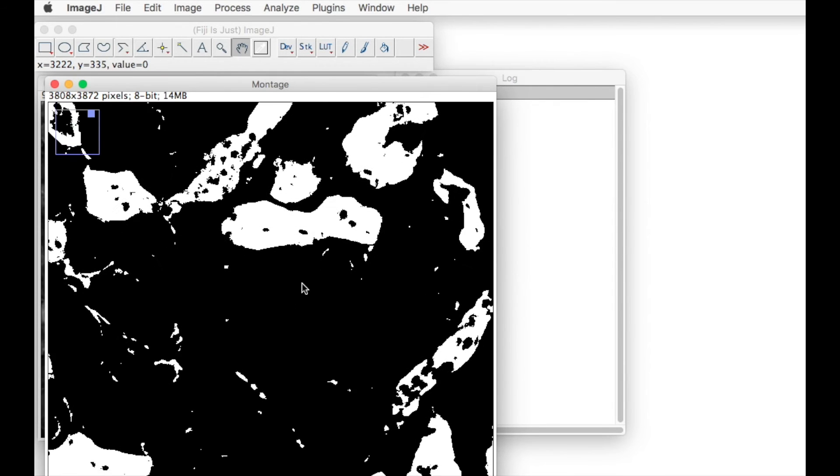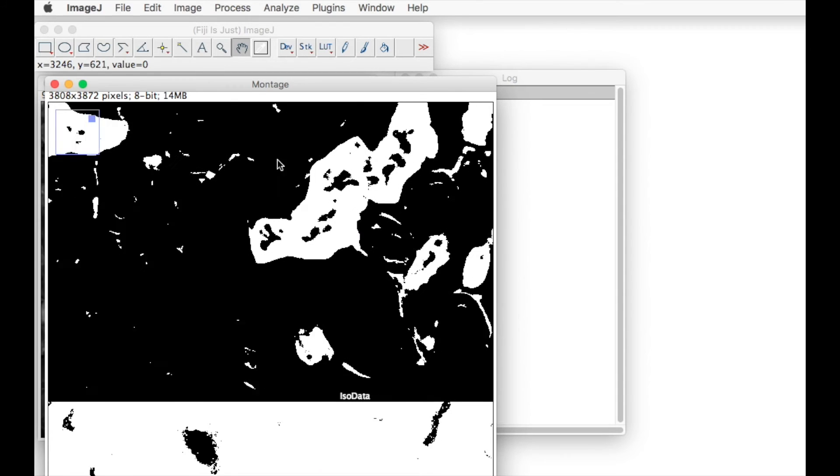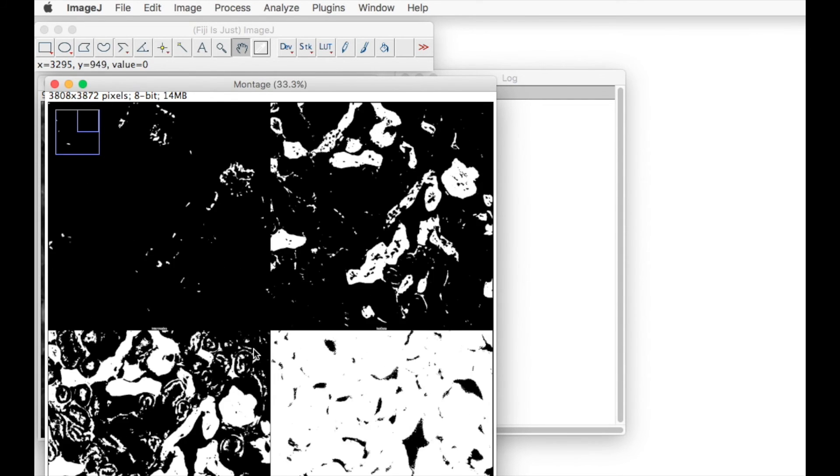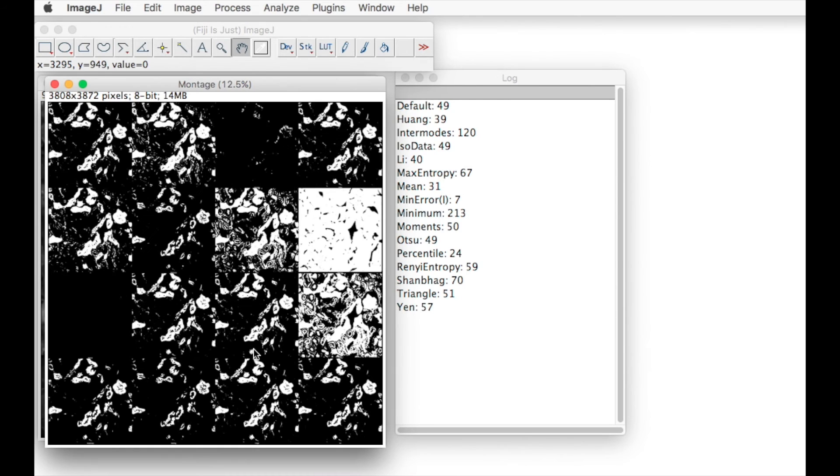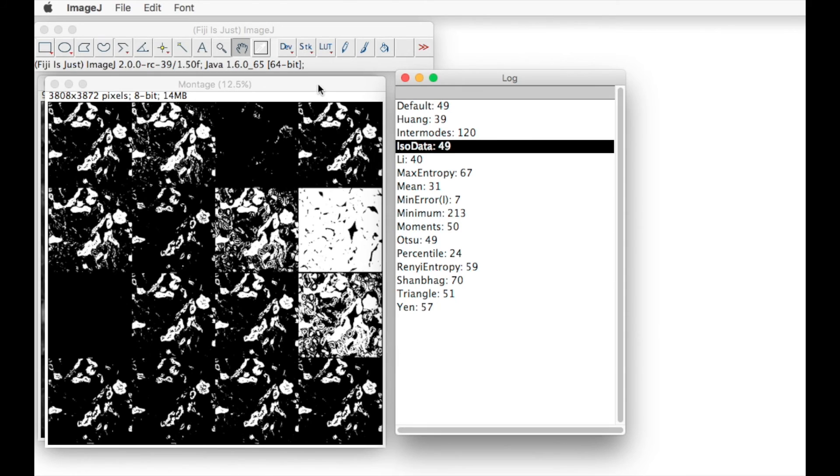We zoom in further and we can see that this is the ISO data threshold, and we can see that it uses a threshold value of 49.